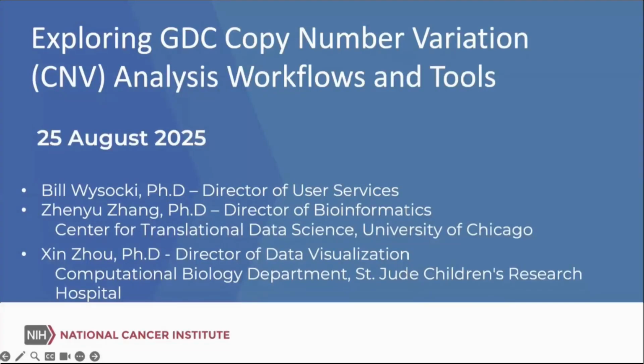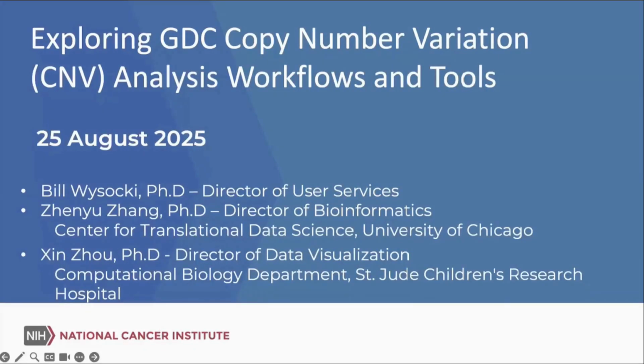My name is Bill. I am the lead for the GDC User Services team, and I'm here with my colleagues Zhenyu and Chin. I'll let them introduce themselves at their sections. But today I'd like to talk to you about GDC copy number variation analysis, workflows, and tools.